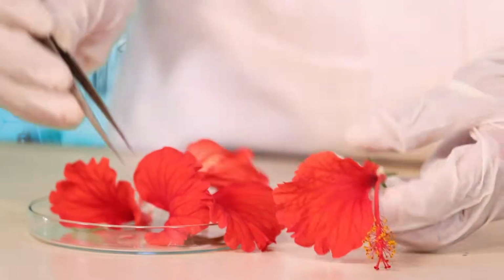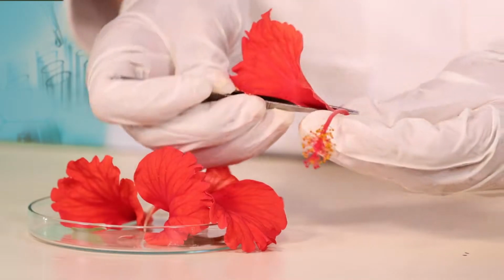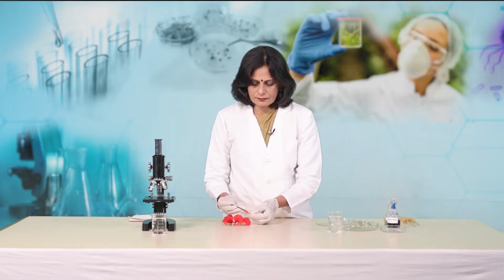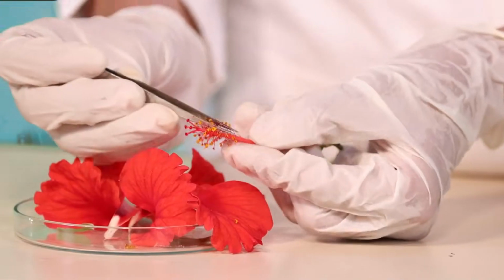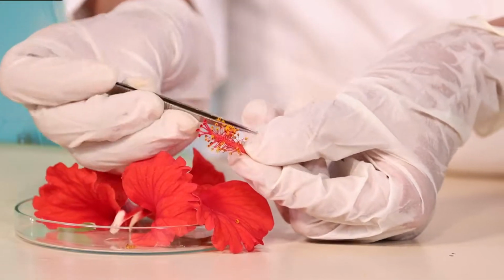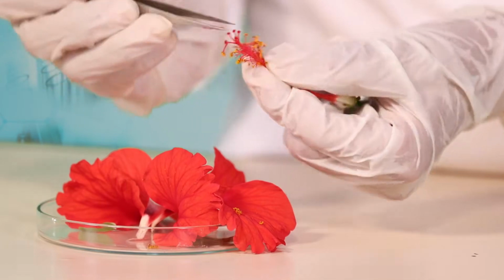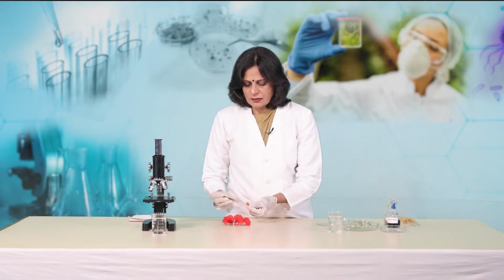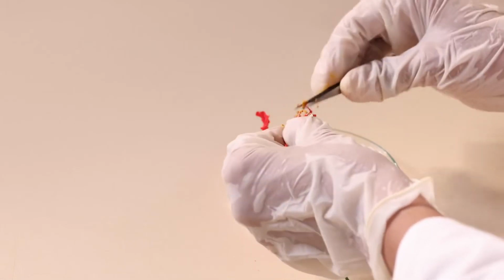So, these are the petals which we are removing, and now we have to remove all these anthers. Basically, what we need is the stigma. So, we are going to remove all these stamens, and as you can see, these are the stigmas and this is a part of the style.